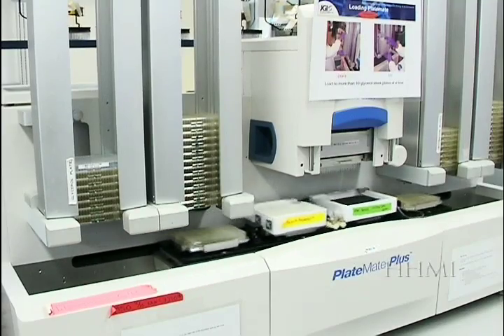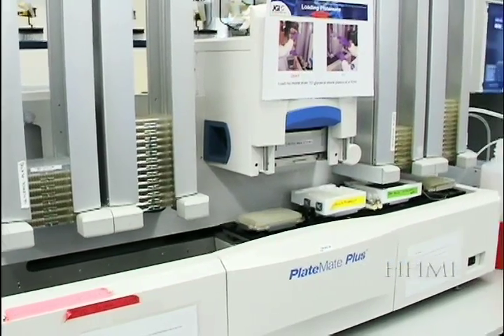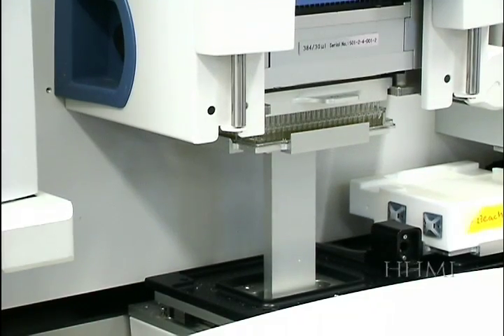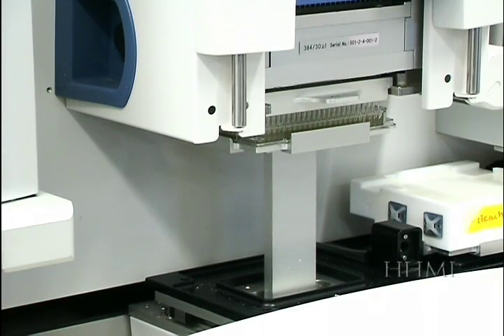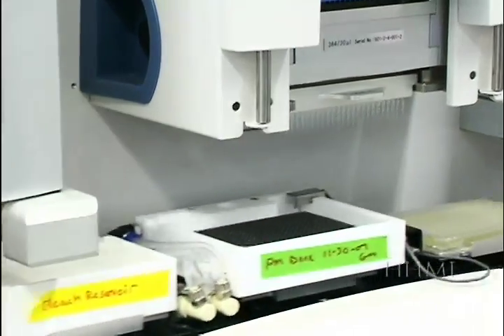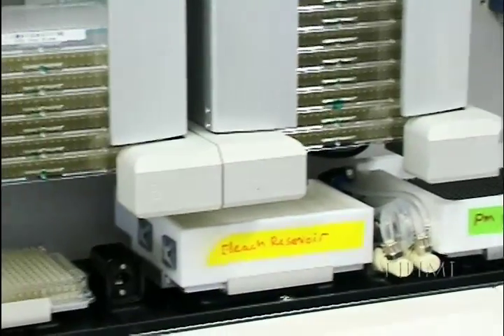The first step is to place the 384 well plates into a plate mate plus robot. This transfers the E. coli into a new 384 well plate that contains a TE buffer solution, which protects the DNA, as the following processes are meant to break apart the cell walls of the E. coli bacteria.